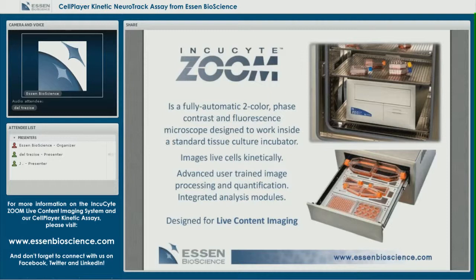There's a single microscope objective that resides underneath the cells, which moves around, focuses on particular fields of view or points of interest within the microtiter plate, and then moves on, having taken an image, to the neighboring well. So hopefully that's reasonably clear.